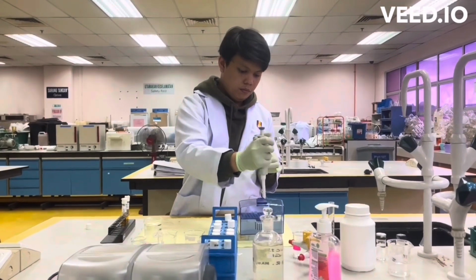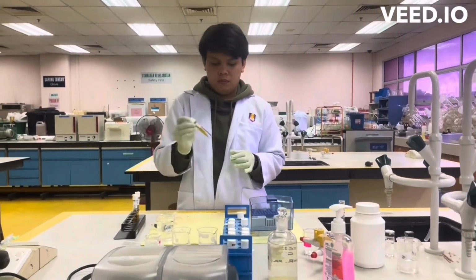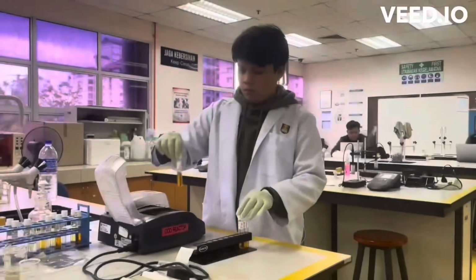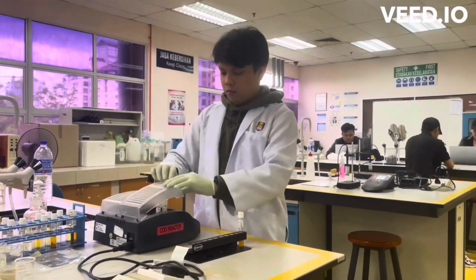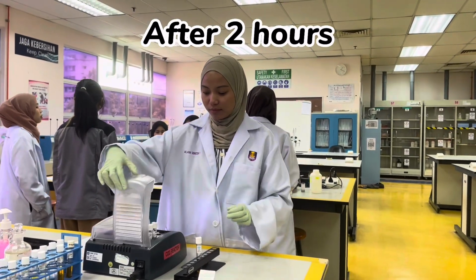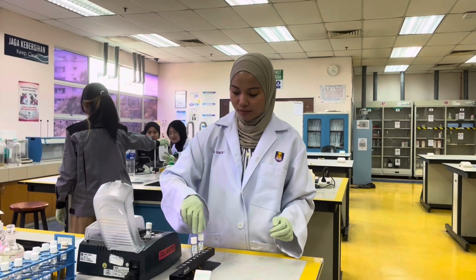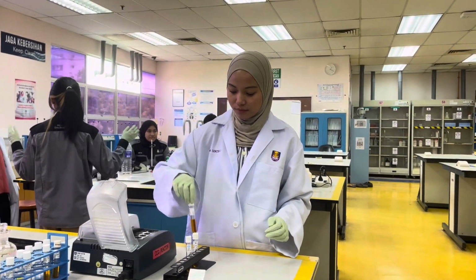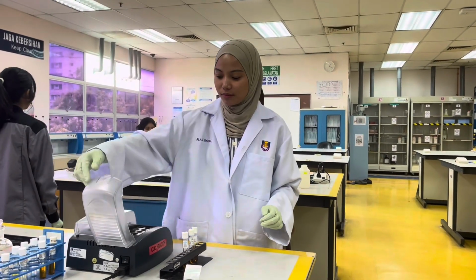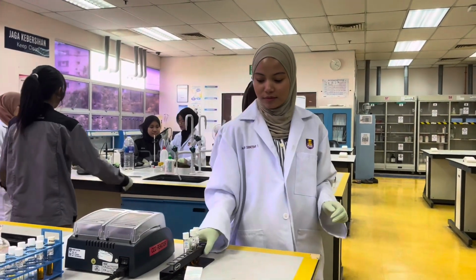And after that, we will use the COD reactor to heat the samples before measuring them. After 2 hours, turn the reactor off and wait about 20 minutes for the vial to cool down to 120 degrees Celsius or less. After that, take the vial out and place it into the rack and wait until it cools down to room temperature. After it cools down to room temperature, turn on the spectrophotometer.